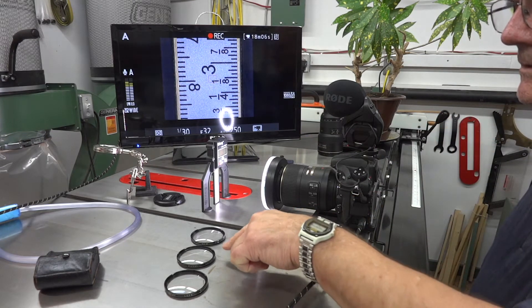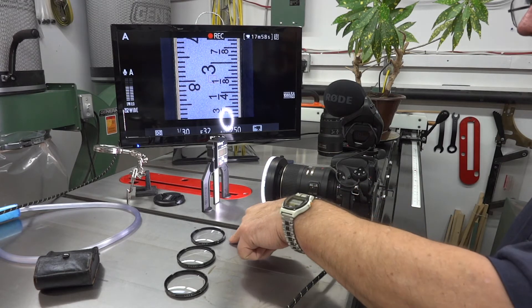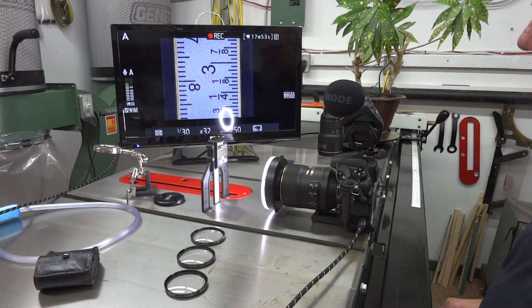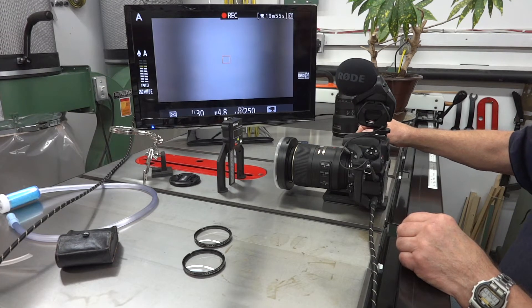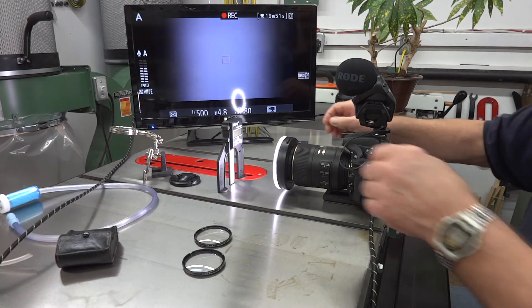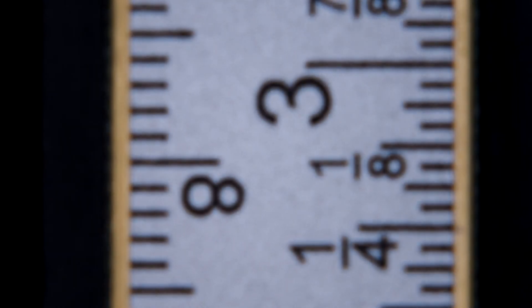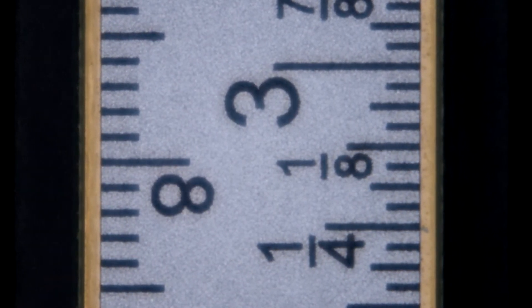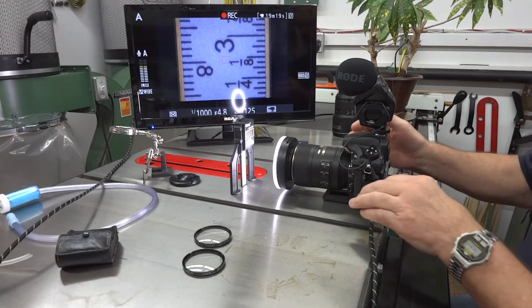These close-up filters come in 1 diopter, 2 diopters, and 4 diopters — and these glasses I'm wearing, I think they're 1.5 diopters. So I'll put on the maximum one and see. I have the 4-diopter lens attached now and let's see how it changes the magnification. I can tell right now I will not be using these lenses, because even though it is much bigger, even with just one lens it's pretty fuzzy.